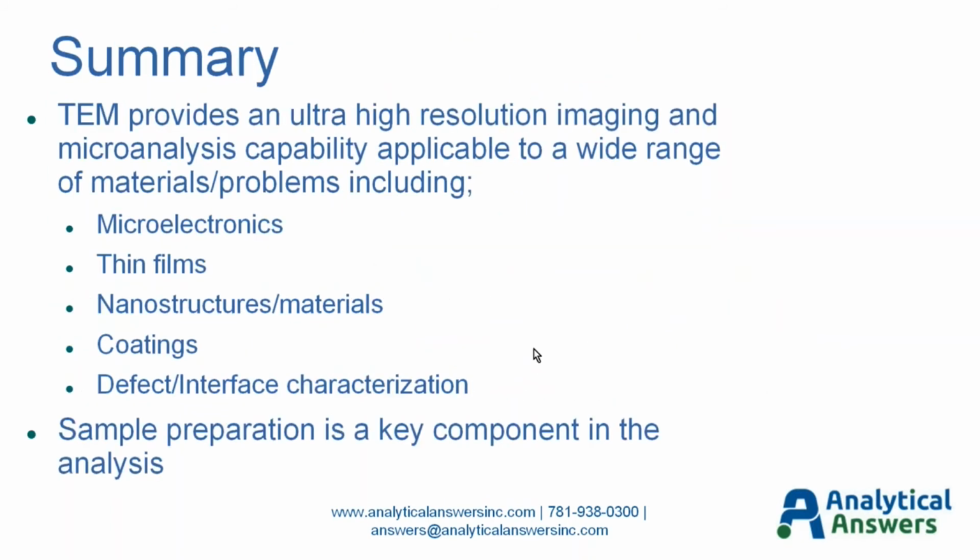So in summary, a high resolution imaging and microanalysis capability. It's applicable to a wide range of materials. I've shown you some examples from microelectronics, thin films, coatings, nanostructures, small defects, and interface characterization is a real strength of the technique. And not to lose sight of the fact that sample preparation is a key component in the analysis. You need a high quality sample prep to achieve a high quality TEM result.